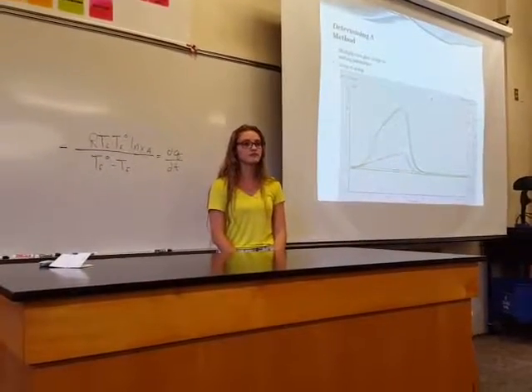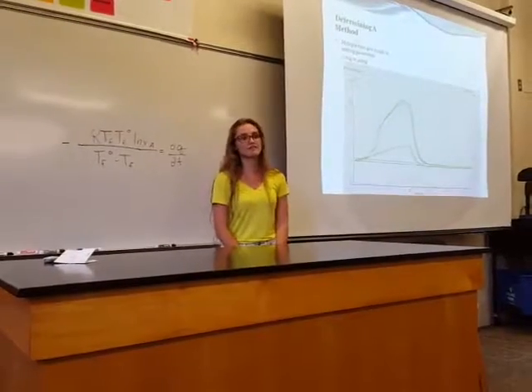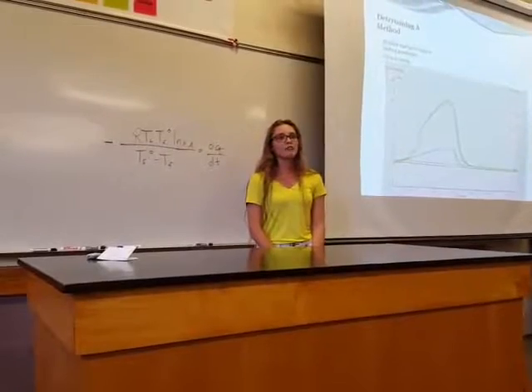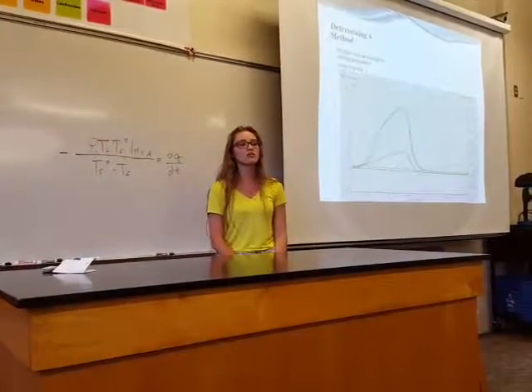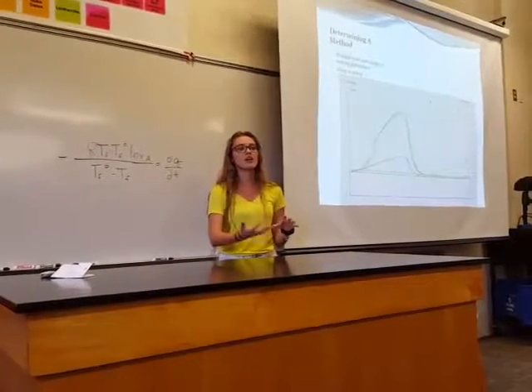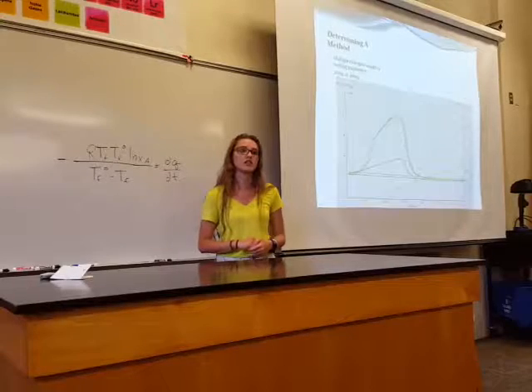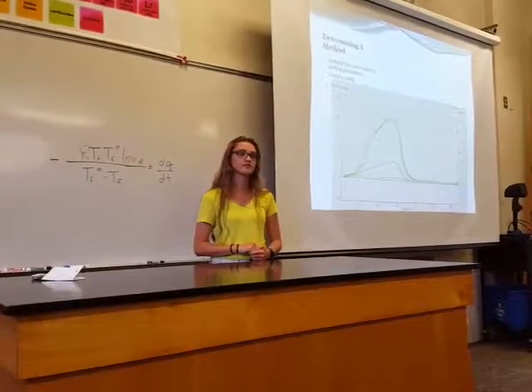Another related question. You said you ran your reference cell empty? Yes. Why didn't you put solvent in there? That was just our initial decision to run our reference as empty, just to take away any possible background from the machine itself, just in case there were any problems with the machine.